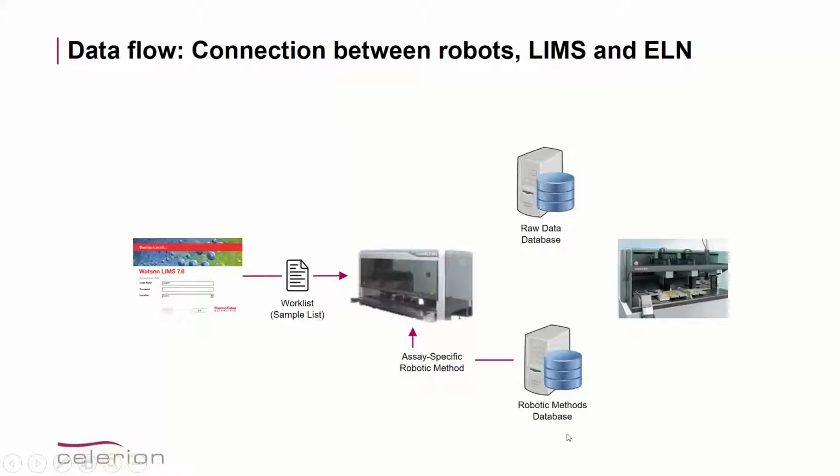On the other side, from our robotic method database, one assay-specific robotic method is loaded that defines the pipetting parameters like volume, mixing, or the source and target position. It basically defines what the robot needs to do.